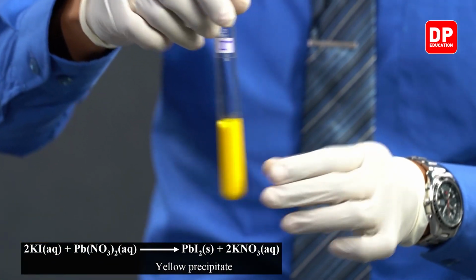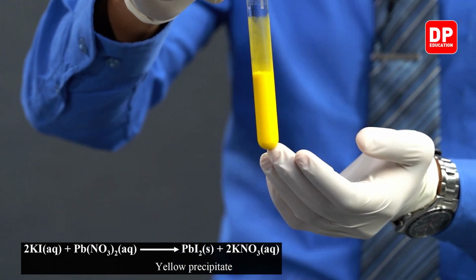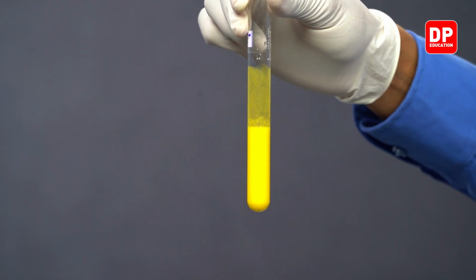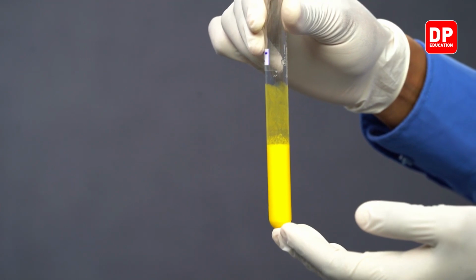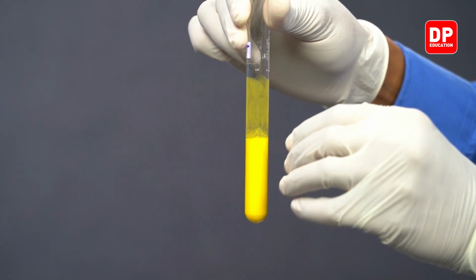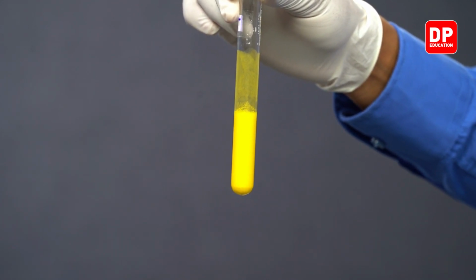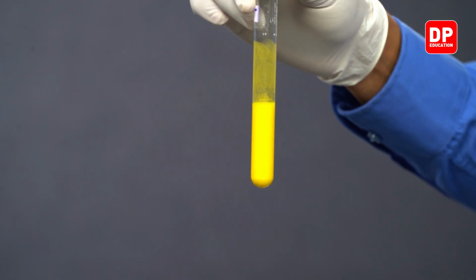So let's give it a little shake. Now you can see the entire solution appears to be yellow. Do not be mistaken. This is not a yellow color solution that is formed. Instead, since the precipitate that is formed is quite fine in nature, it is dispersed in water, or we can say suspended in water, forming a suspension of the precipitate. So we will leave it aside to observe if it collects at the bottom.